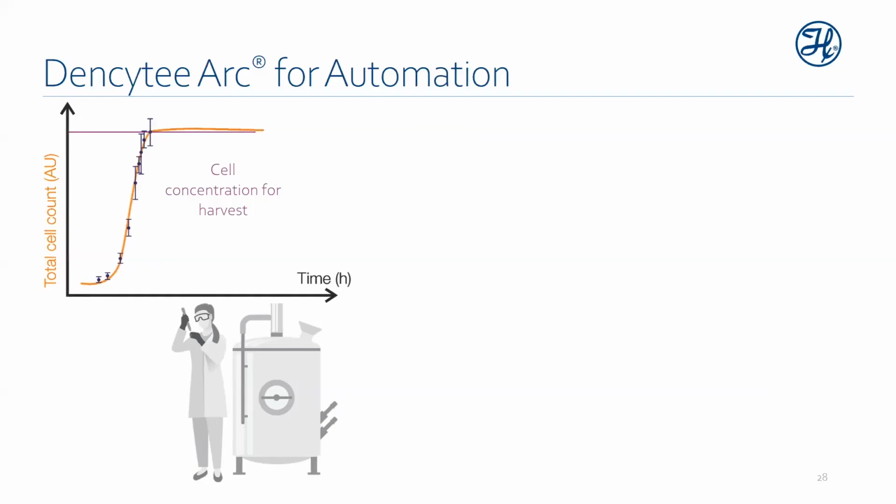So we've talked about looking at values and making a determination. The other thing that an inline signal provides is the ability to automate. With offline OD values, you have to physically take the sample and make the process change on your own. With an inline measurement, the signal is continuously output in a variety of communication formats, and it enables you to not only remove that manual aspect, but also add redundancies, relays, flags, alarms behind the system.